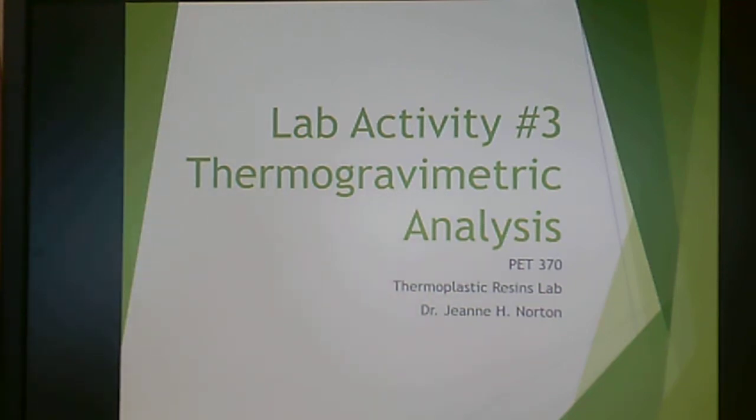Welcome to lab activity number 3 for Thermoplastic Resins Lab. This is your Thermogravimetric Analysis lab. I'm going to walk through the Canvas module for you as an overview before you start the activity.